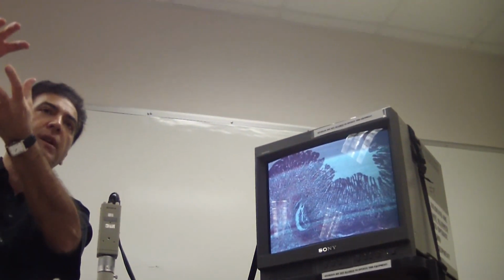Guys, I think this slide that you have inside the box comes from the fundus region. In fact, it says the stomach what? Fundus. So remember the top portion.